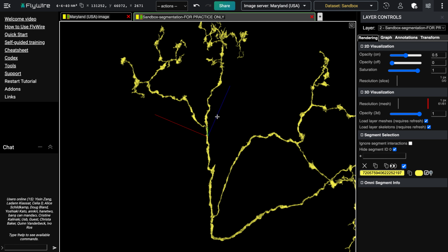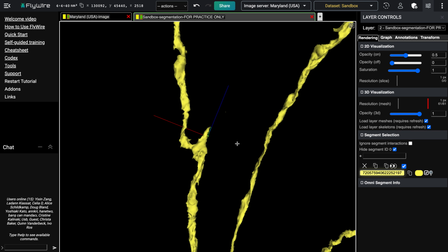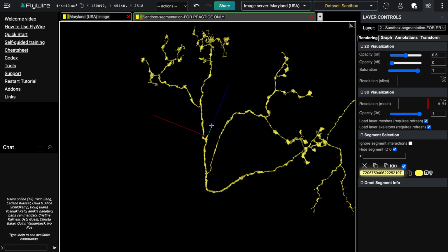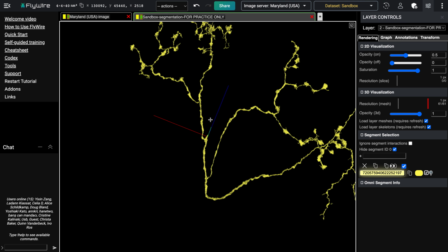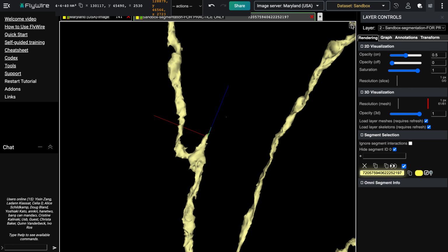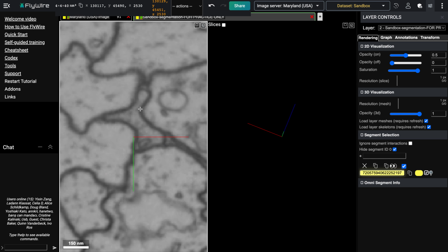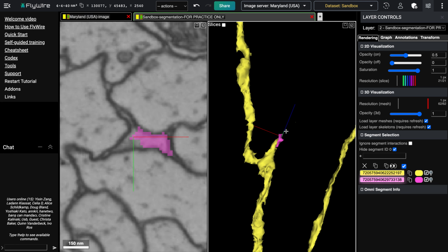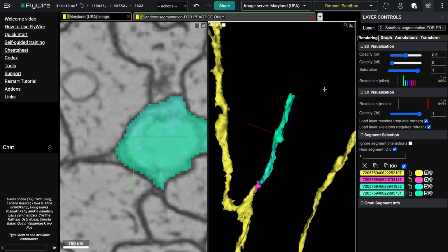So as I'm taking a closer look at this cell, I'm also noticing that there's this little nub projecting right here. So that's a place that I'm going to take a closer look at to see if there's an extension or not that might come out of this location. Okay, let's get the EM images here. All right, and it looks like this continues right here, so I'm going to click that. Here. Looks like it continues here.